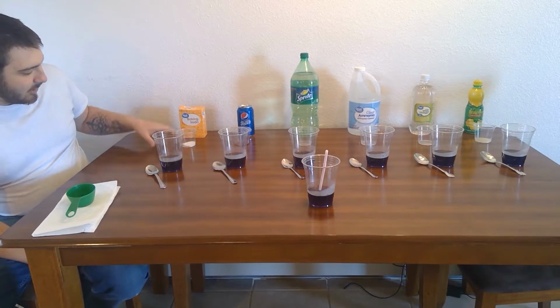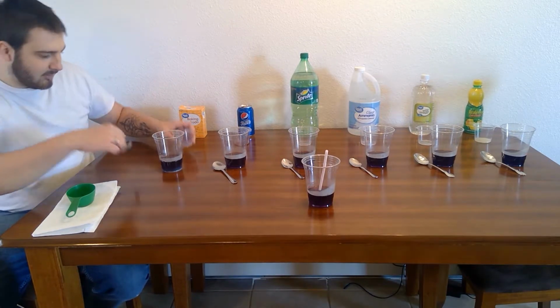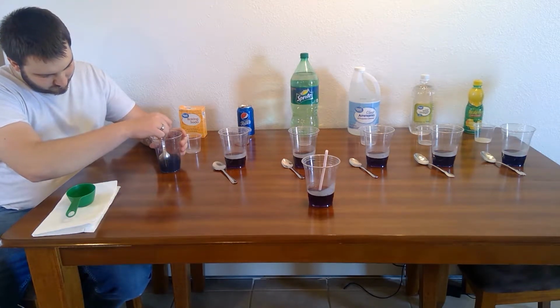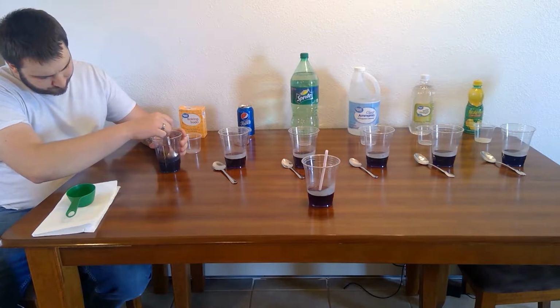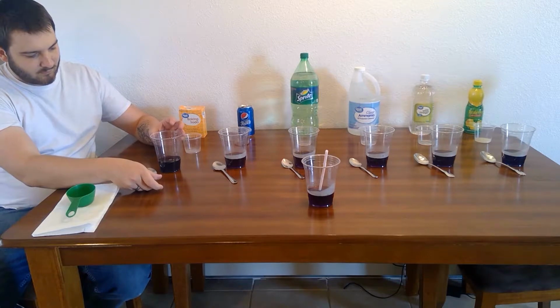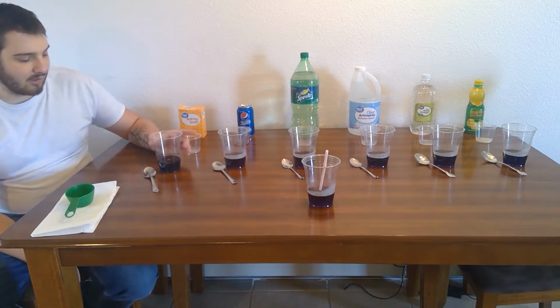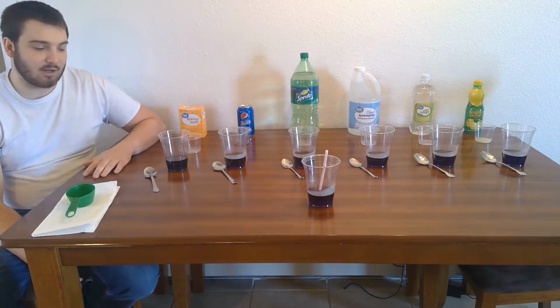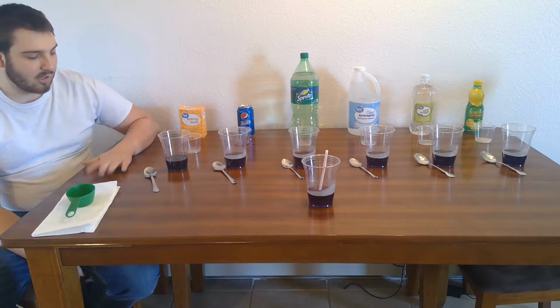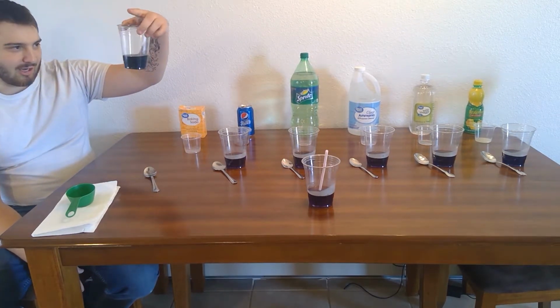The first is the baking soda. With the baking soda, we noticed that instead of being a dark purple like usual, it turns to more of a blue.